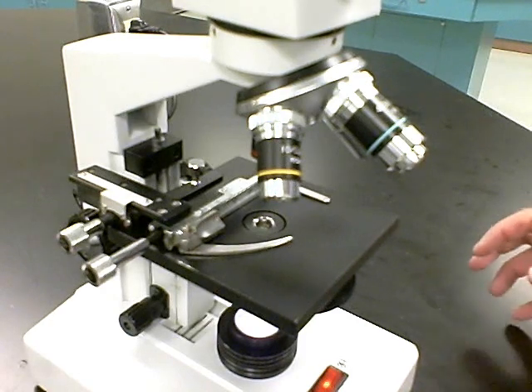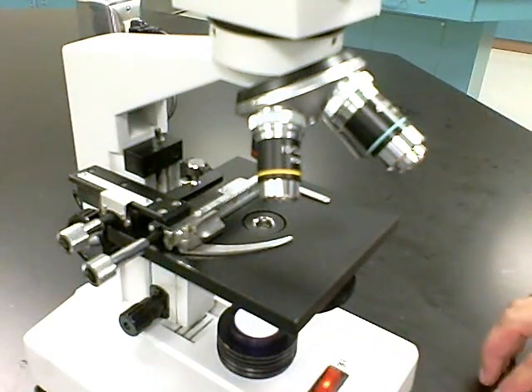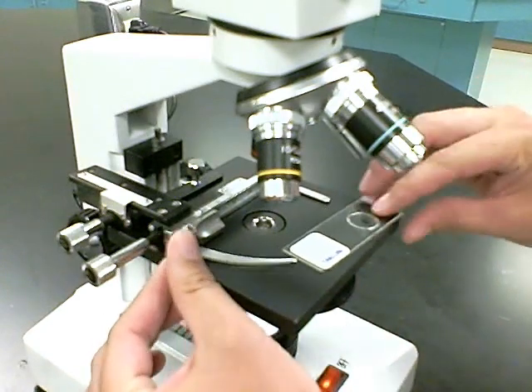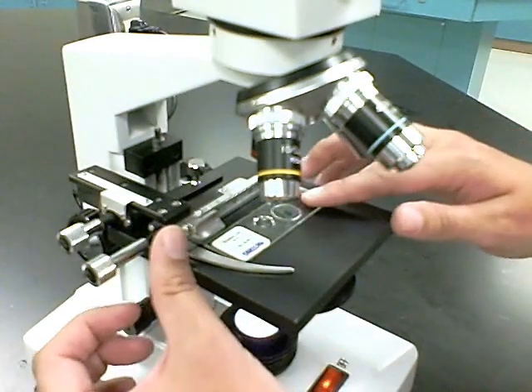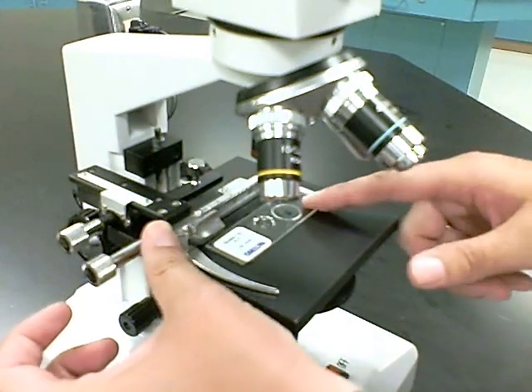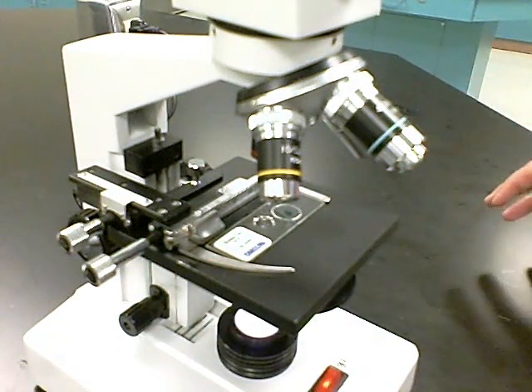You'll notice that some of the microscopes you might use have a mechanical stage, and they do not have the normal slide clips you see on the non-mechanical stages. The way you insert a slide onto this slide holder is you open this arm right here, you simply place your slide in and release, and that holds the slide into place. You never want to try and place the slide underneath this arm right here as you would with the non-mechanical stage clips. With this one, you just put the slide into place and that will hold it right there.